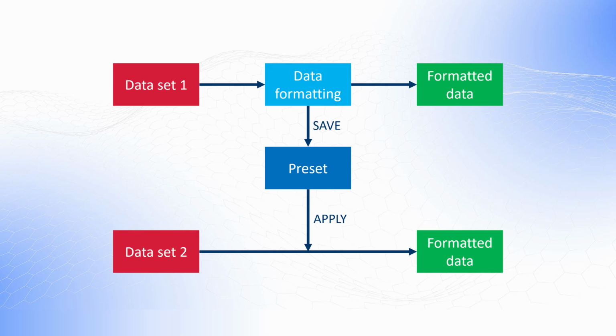This feature is the most useful when, across different projects and datasets, you work with the same dataset format all the time, the one that differs from the format required for MonolixSuite applications. Thanks to this feature, you actually do not need to go through the data formatting steps each time.